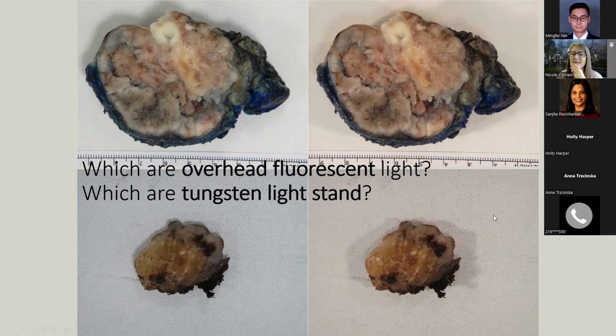So here are my suggestions. One, you can clean up the background and essentially make both the background cutting board and the shadows go away by just putting a colored paper over the background, so that then your specimen is not on a shadow at all.